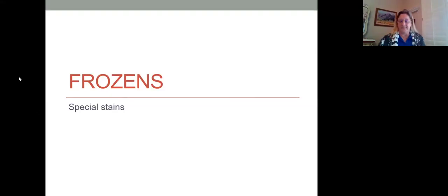Hello again, students. So those of you who just finished watching the basic Frozen lecture, now we need to start talking about Frozen sections that have special stains done on them, and the protocols and procedures, steps, functions, and results for those. I'll also give you examples of what they will look like microscopically.